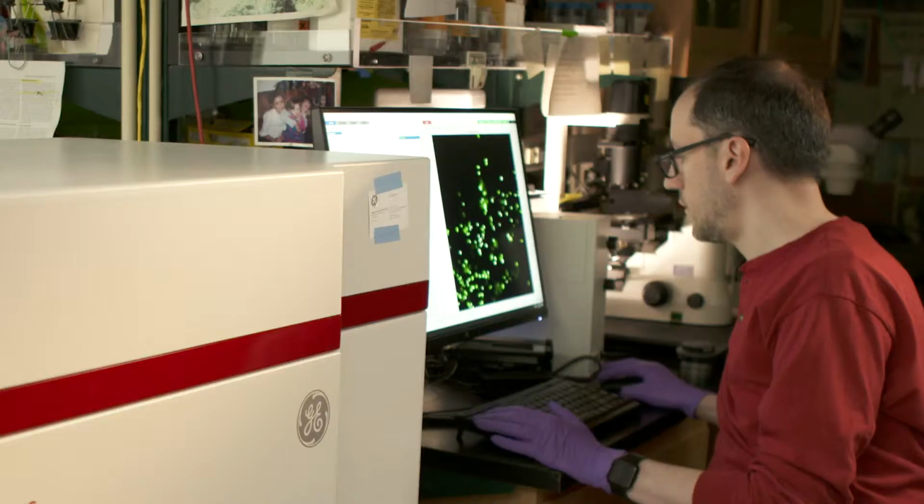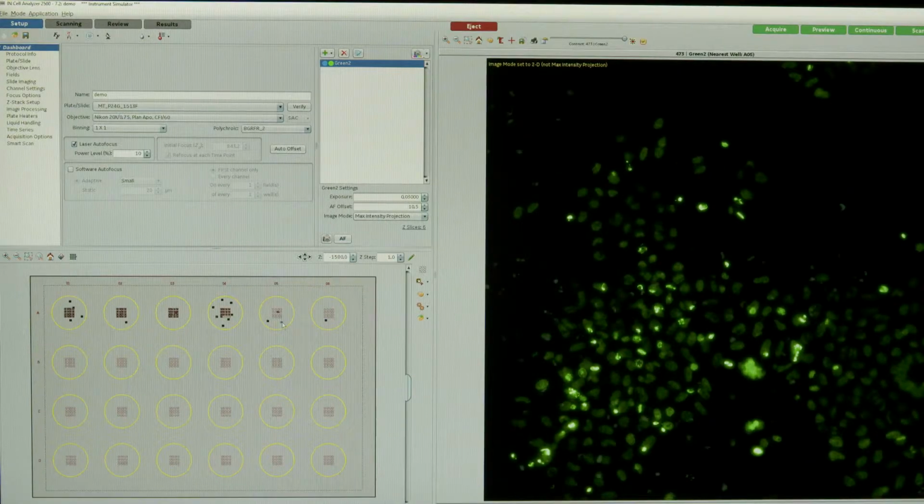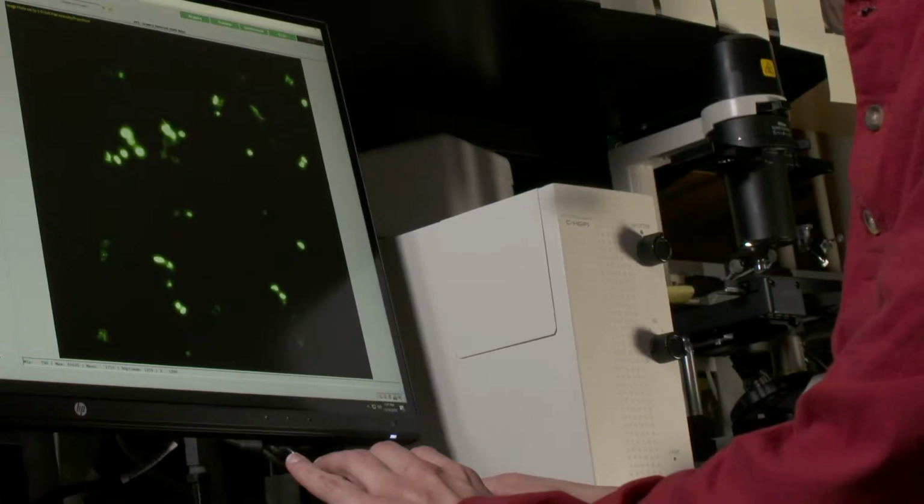You sat down at a microscope and start counting monasters versus regular cells, interphase cells. Usually it takes you around 3 weeks to finish this counting. So basically with Phenoglyphs and InCarta, you can finish the experiment in 1 day compared with the 3 weeks that it can take you with the regular system.